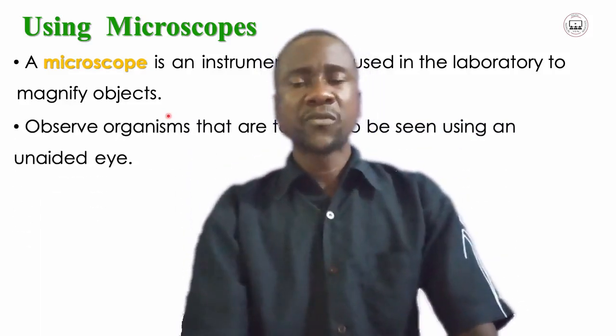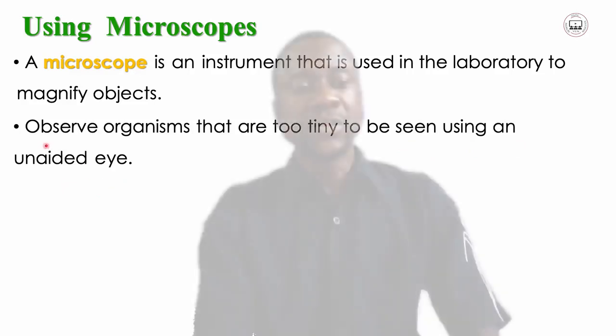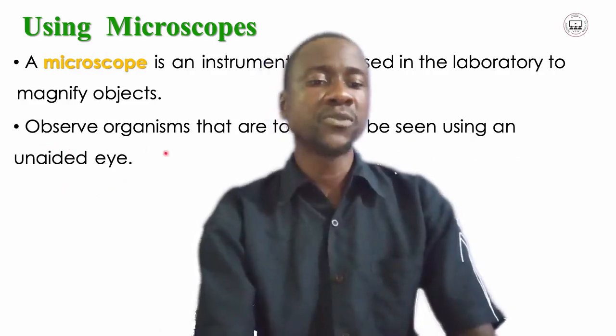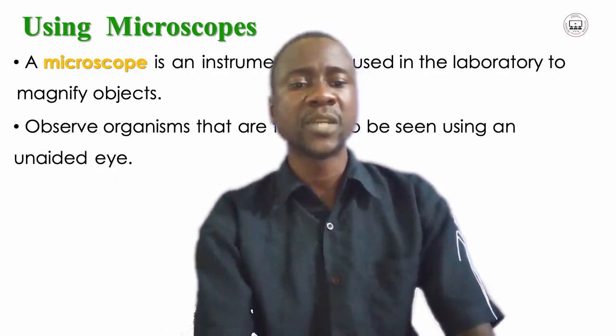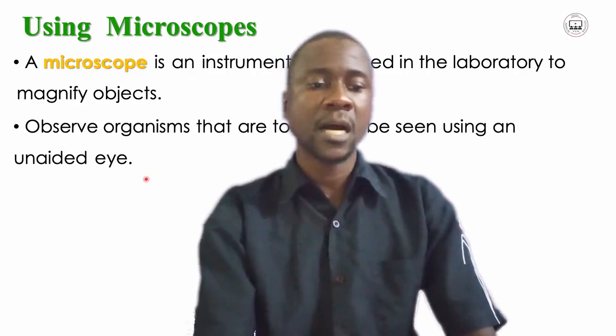The microscope could be used to observe organisms that are too tiny to be seen using an unaided eye.